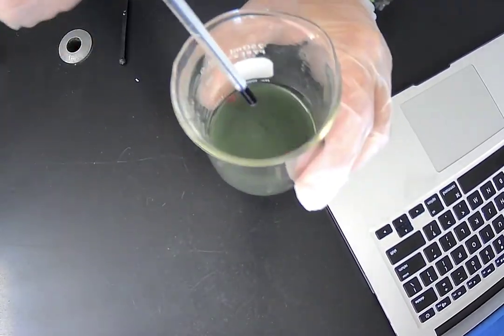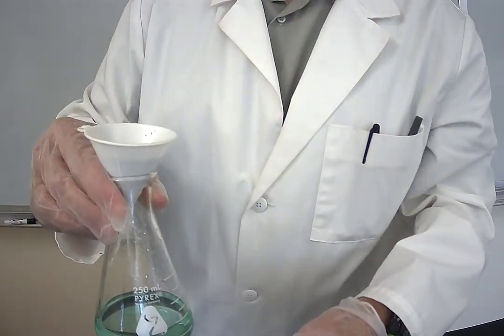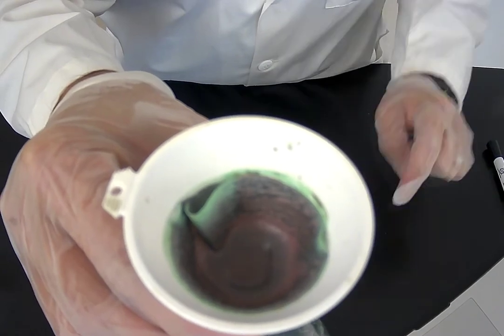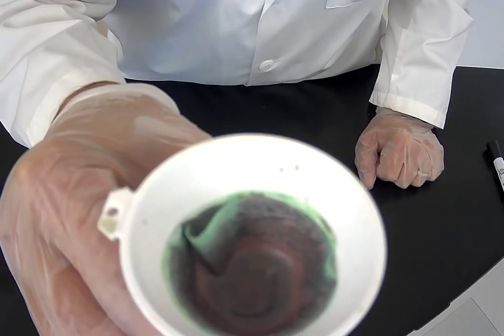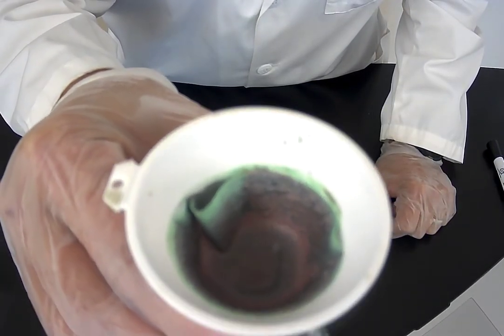All right. Before I end the video, what I'd like to show you is when students do this in class, I have them pour this waste, all of it, into a waste bin. And what I've done is I take that waste and I filter it using a funnel. You can see the reddish brown substance that we made is right there in the filter. Those particles are too large to go through the filter paper, so they get trapped based on their size, right, physical property.